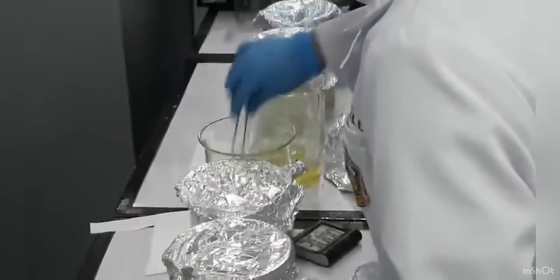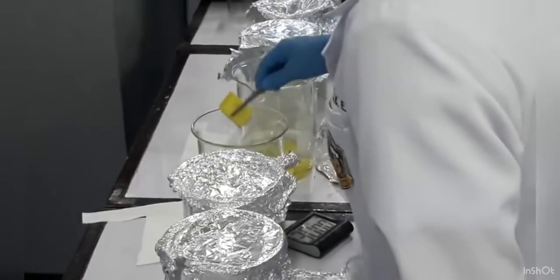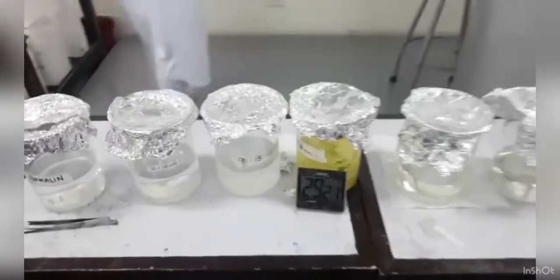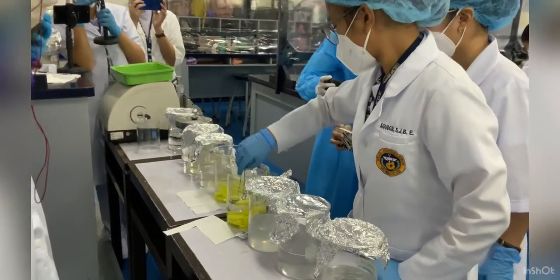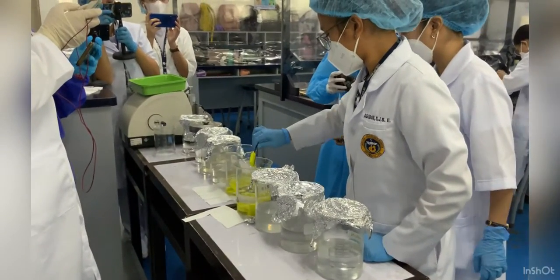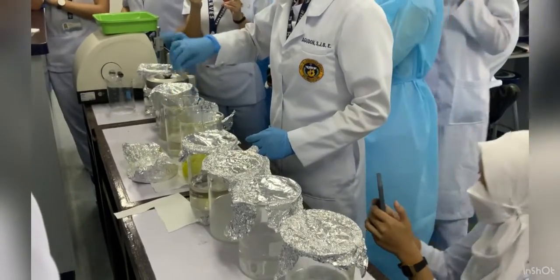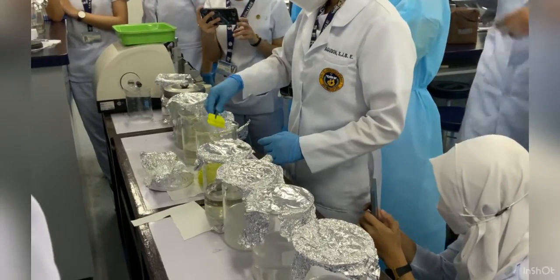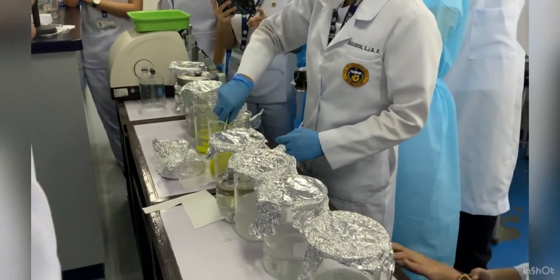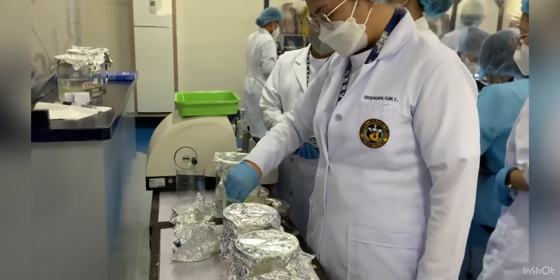Next, transfer the specimen to a 90% ethanol and leave it for another 15 minutes. Then transfer it to another 90% ethanol and leave it for 25 minutes. After the 90%, transfer the tissue sample to a 100% ethanol for 30 minutes. And transfer the tissue sample again to another 100% ethanol and leave it for 30 minutes.